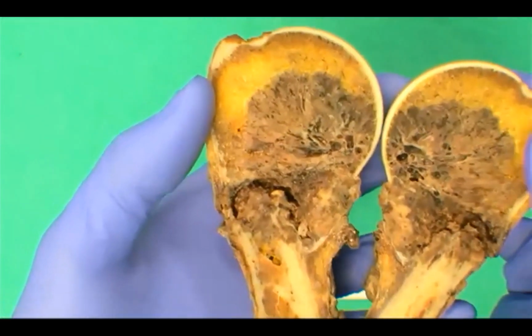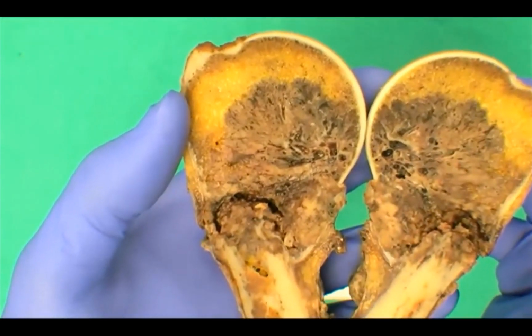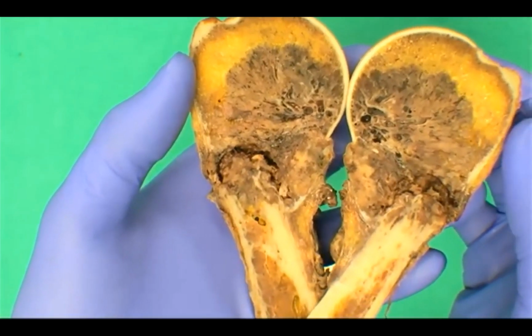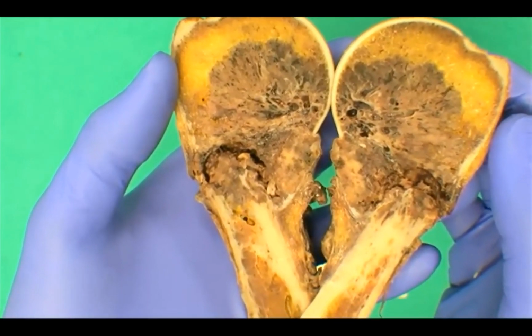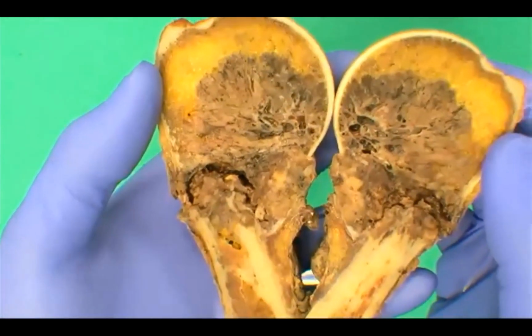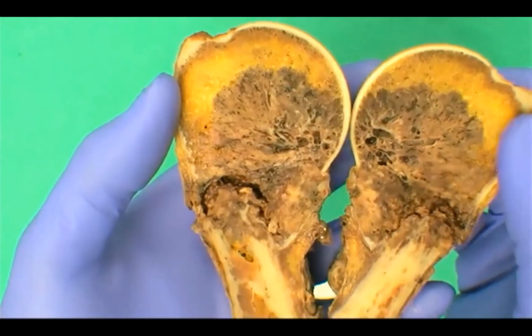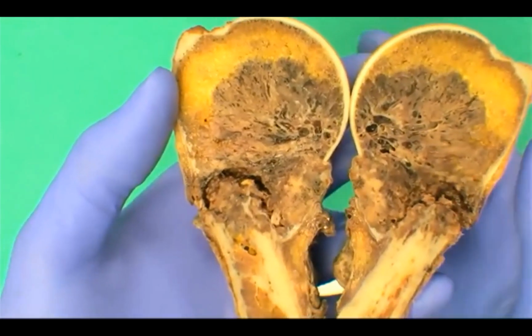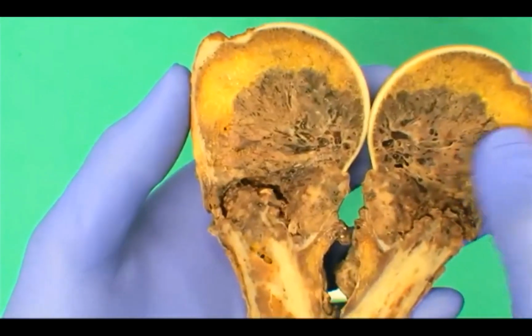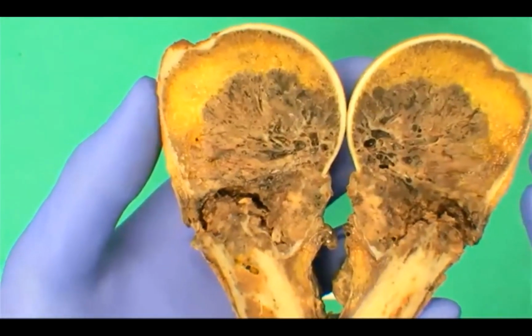Okay. With all of our bone specimens, we connect with our pathologist to do a review and kind of have a chat about what is appropriate for sectioning. This is particularly important for our sarcoma specimens. We usually cut this and block it out, have a conversation with our pathologist about what's appropriate.